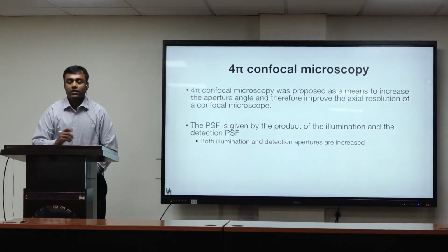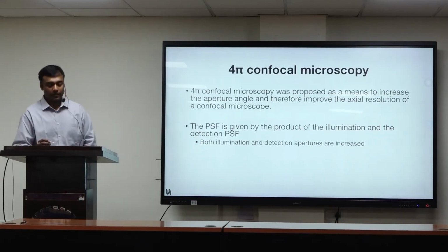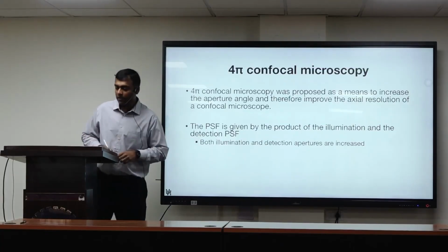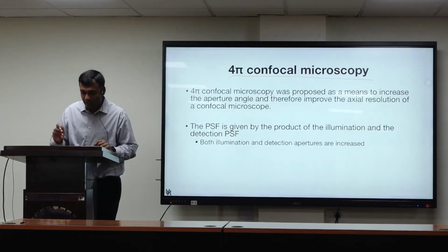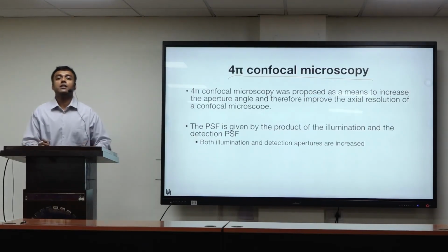Alright, so let's continue our discussion. There are a few other kinds of imaging systems that I wanted to discuss. Another one was called 4-pi confocal microscopy. It's related to confocal microscopy, but it has some advantages.